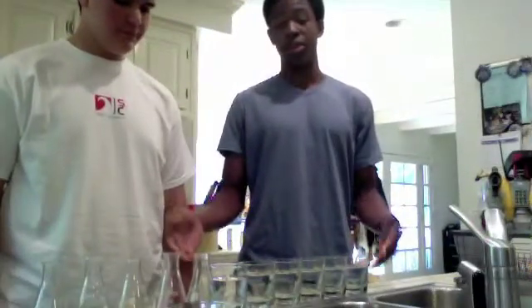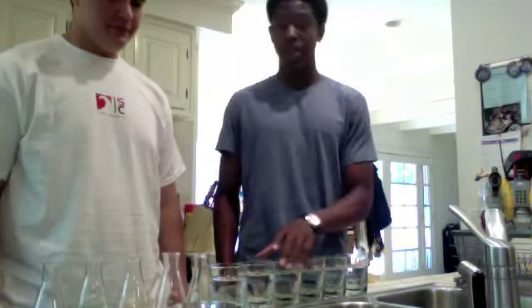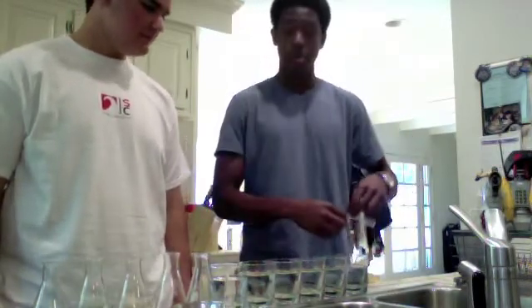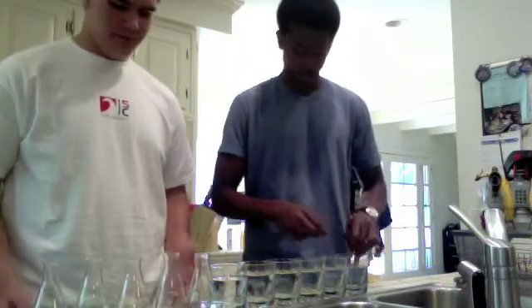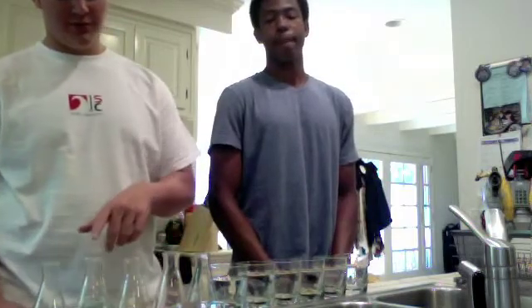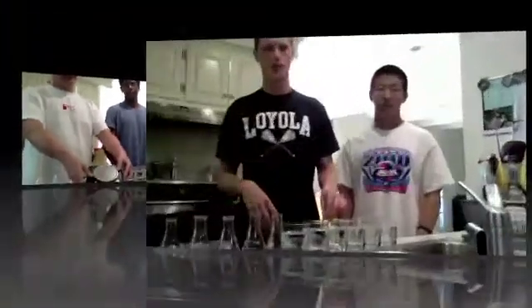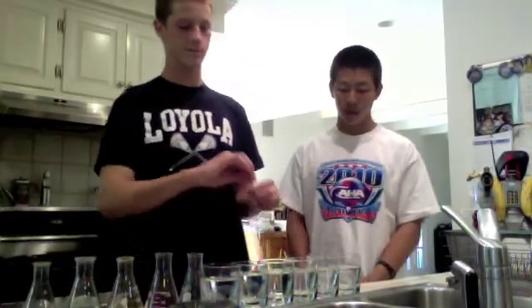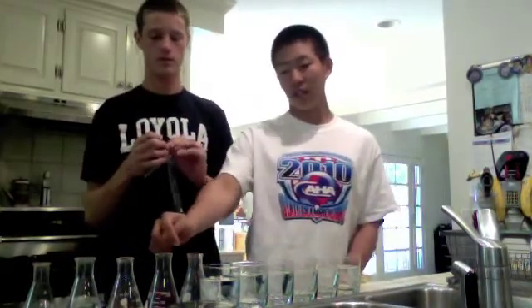Here are the materials that we need for this lab. We have 6 beakers of 250 milliliters of water. In them, we have 6 different pre-soaked dialysis tubes. We have our 6 beakers with our sucrose solutions, 0.2, 0.4, 0.6, 0.8, and 1, and our scale. In setting up this experiment, we must tie a knot in one end of each dialysis tube. Then in each dialysis bag, we will fill a different sucrose concentration, except for one which will be filled with water, and that is the control for our experiment. Now we will proceed to add 15 milliliters of the correct solution to each dialysis bag.